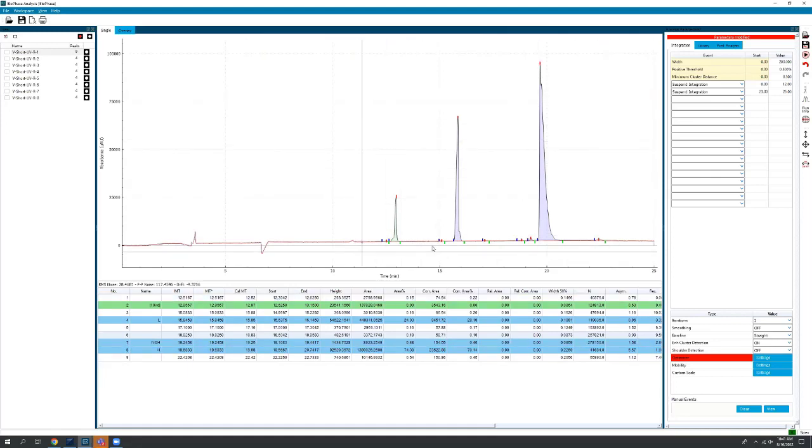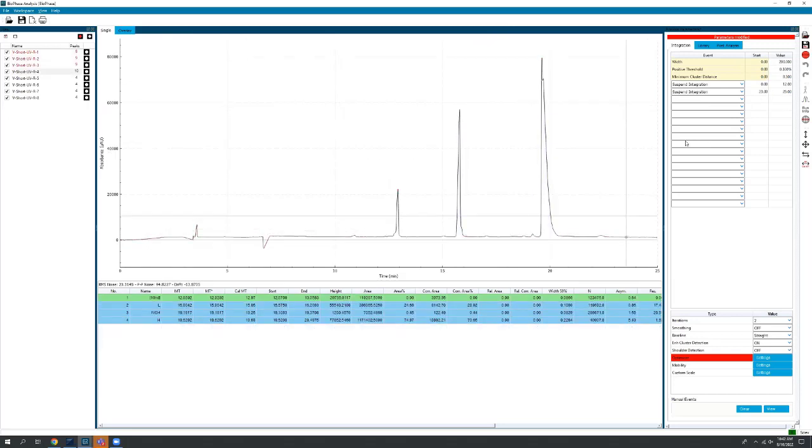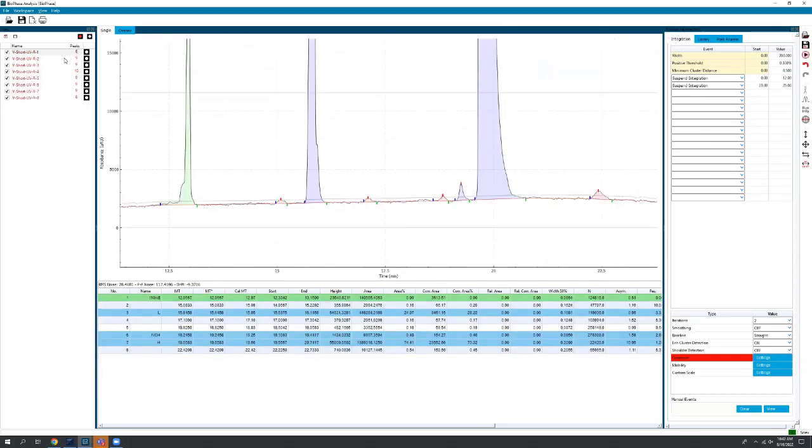So we've got a nice looking set of analysis parameters here that I'm going to apply to check all these other data files. If I right click on here, I can apply these parameters and analyze all those checked data files that I just did. Now we're going to see how those look.